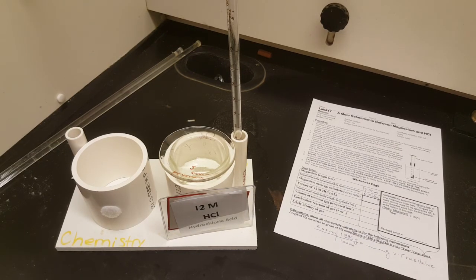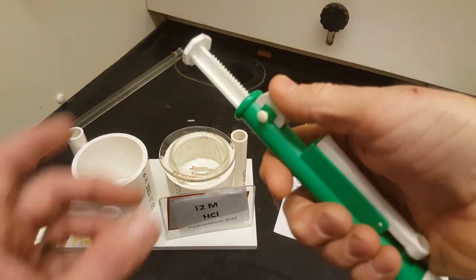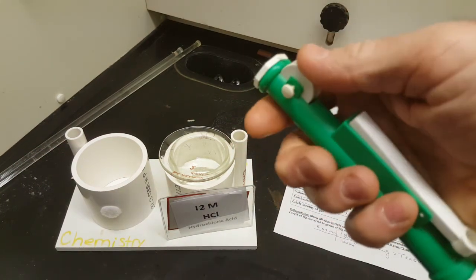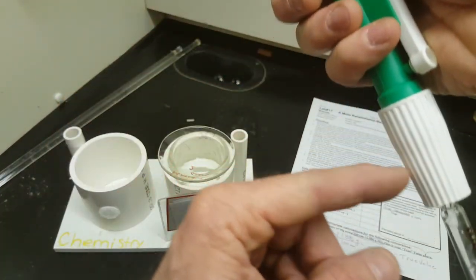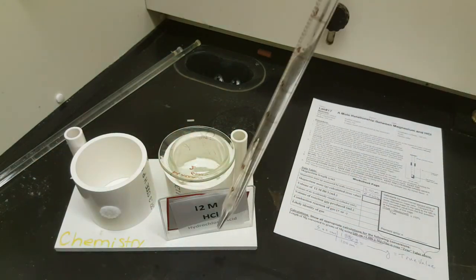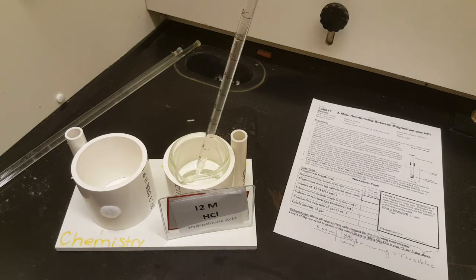The next thing to do is use a Thumbwheel Pipette. If you've never used a Thumbwheel Pipette, that's the Thumbwheel. And with the Thumbwheel rolling upwards, you can depress the plunger all the way down to the bottom. And that's where you want it before you put the tip of the pipette into the concentrated hydrochloric acid.